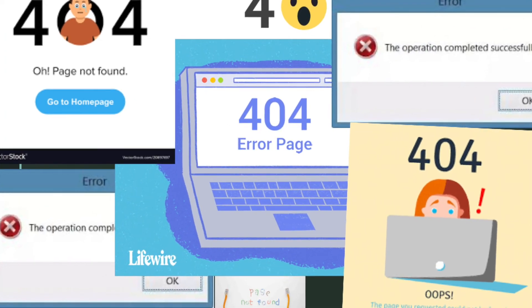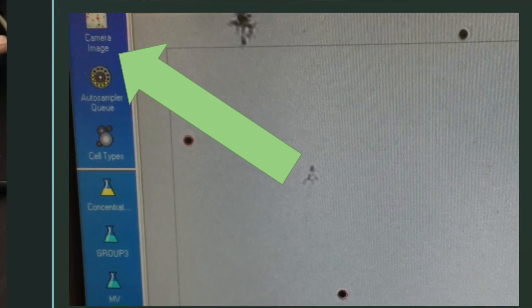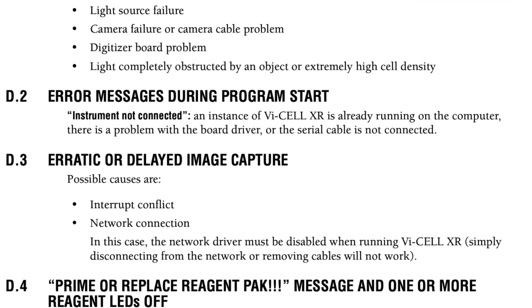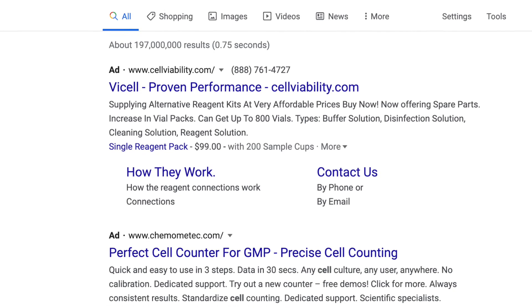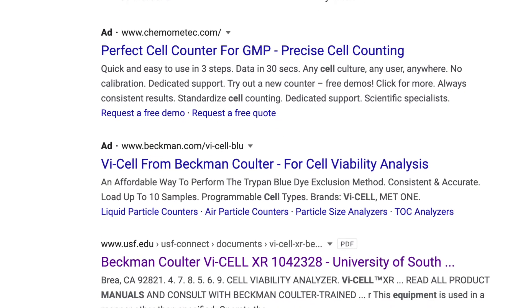A frequent problem is if the camera is not connected: when you click on camera image it will show either an all-white, all-black, or gray screen, and you may or may not receive an error message indicating it cannot connect. If you have any additional questions or problems, please see the reference manual and the online instructions from the company for more information.